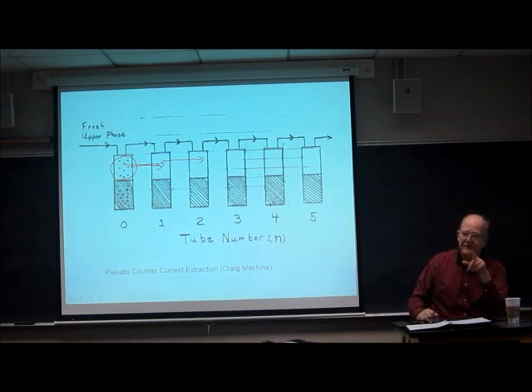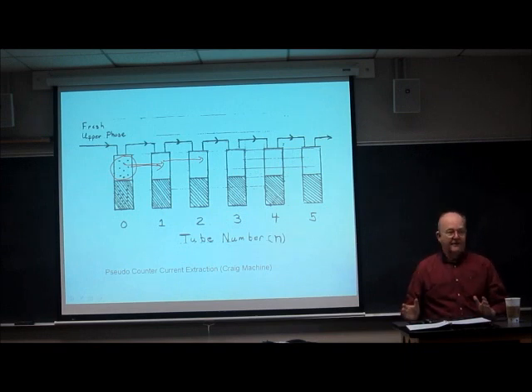Now, if there's a difference in the big K factors for the two solutes A and B, you're going to get a separation. If there's no difference, you're not going to get a separation.